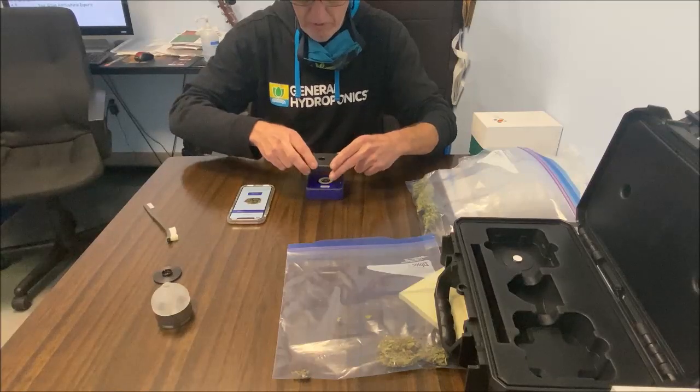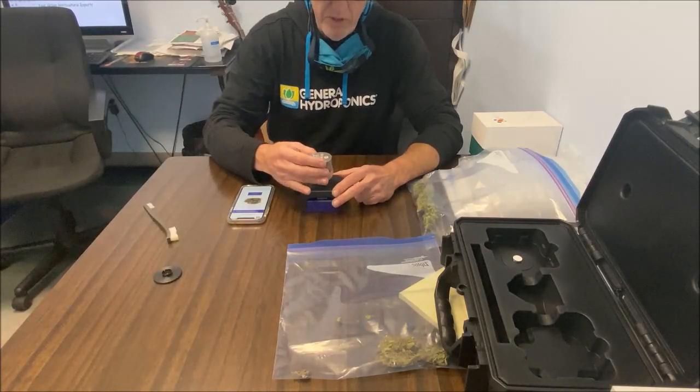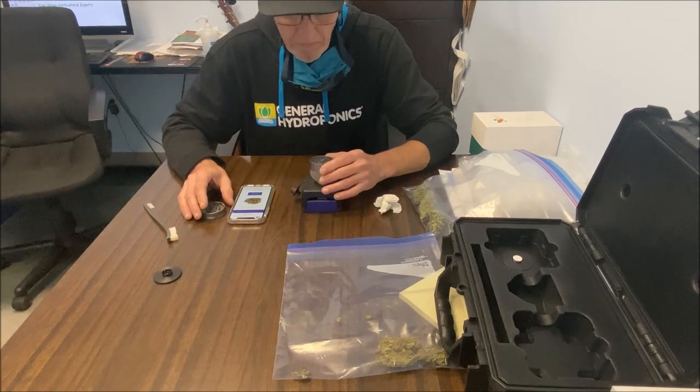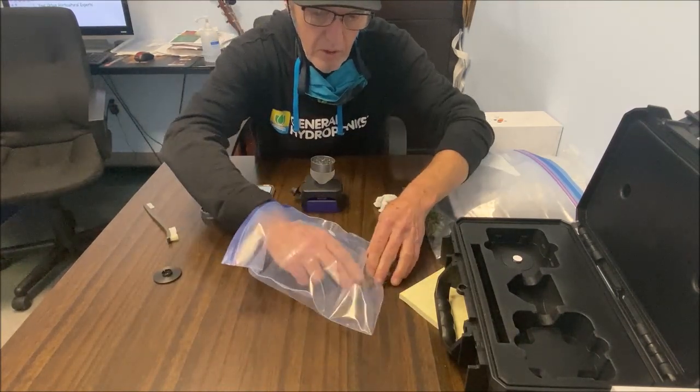First thing I do is put the unit on top. That is basically to hold the funnel. So this is just a standard grinder. It's got a special non-stick coating so it doesn't stick. So I'm going to do the New York OG first. So we don't need a lot.